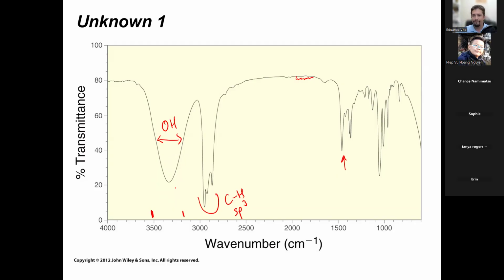Yes. Alrighty. So any questions about this one? And again, sometimes we only get the information about one group and the rest of the stuff. That's why we do NMR. That's why we do TLC. That's why we do melting point analysis. This is just another piece in the puzzle, another way we can analyze compounds to further identify and confirm their identity, right?